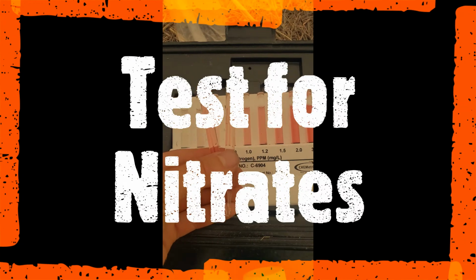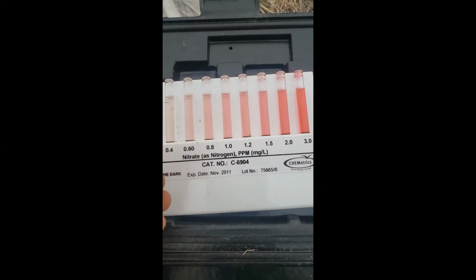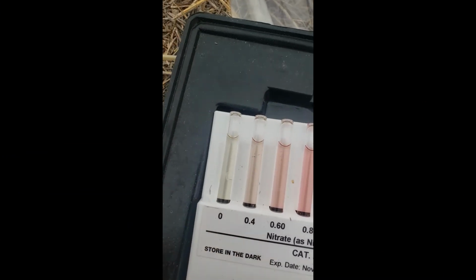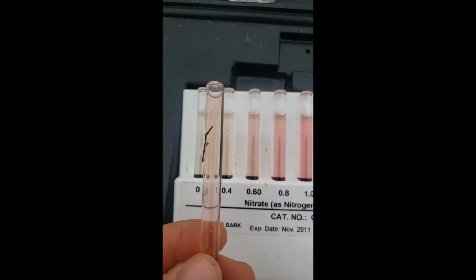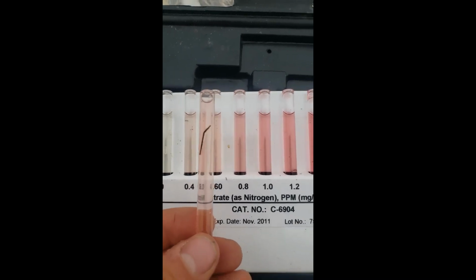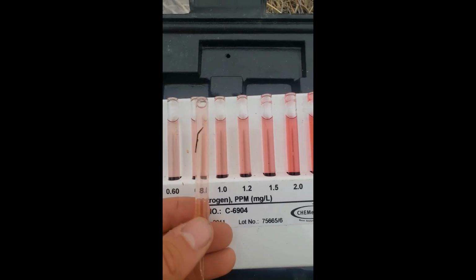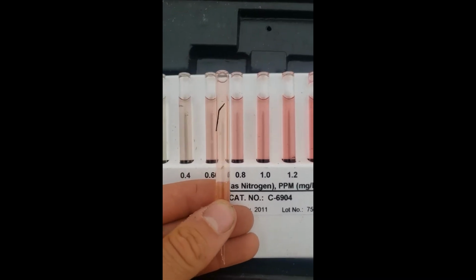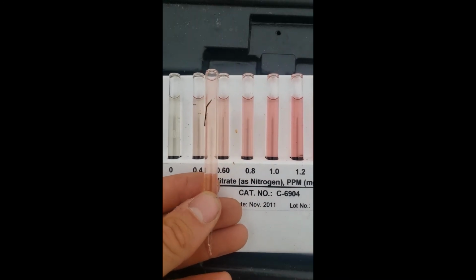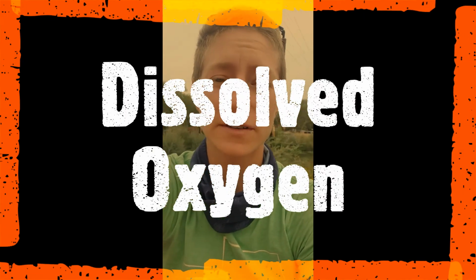Okay, so here on the left is from the pond sample, and the right is the river. So let's go ahead and do the pond. We'll do the pond first. We'll measure it up against that, going each one around and seeing. For me, it looks like this would be about 0.6. I think it matches best with that one. Right around 0.6.